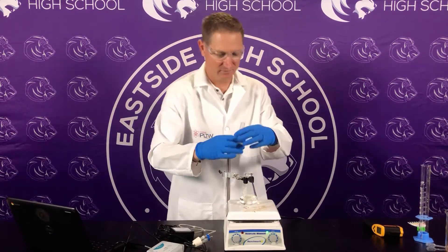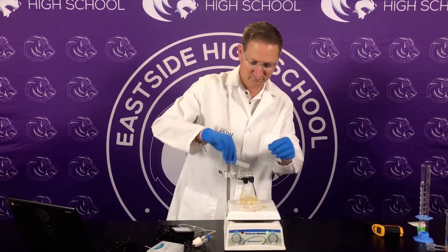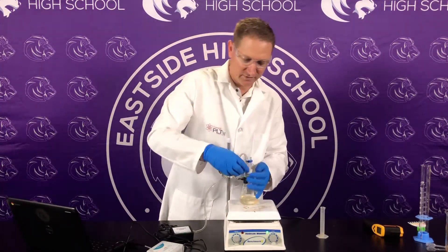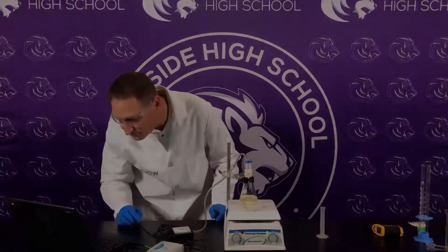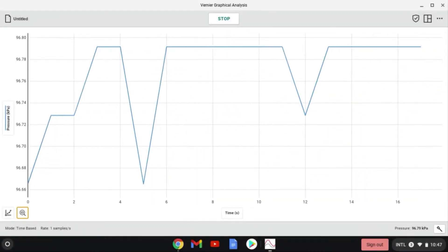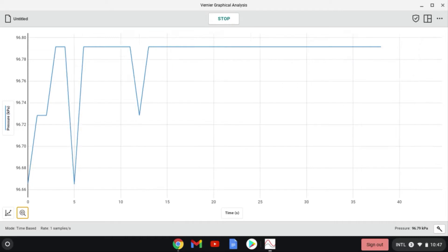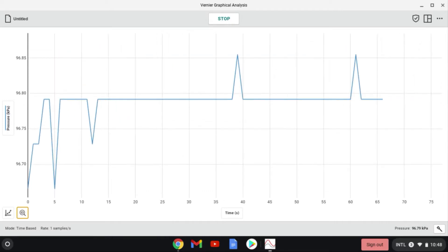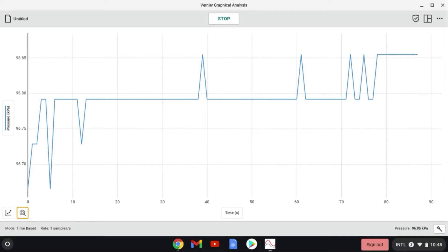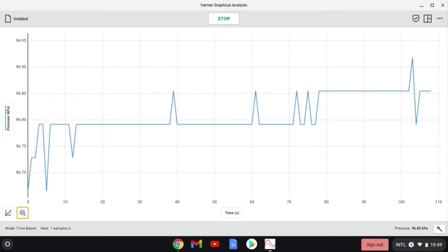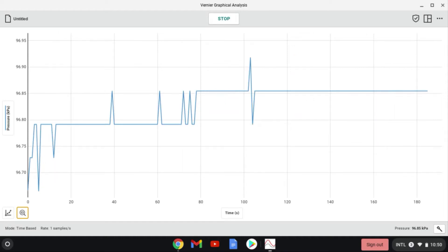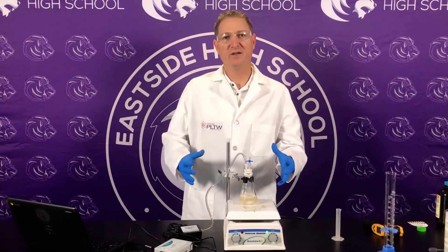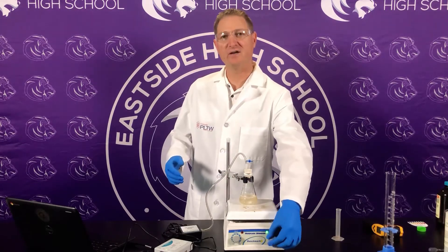We'll see what happens to the rate of reaction. Make sure this is secure — you don't want any of that pressure leaving. Collect. Now that we've collected for 200 seconds, we're going to go ahead and turn this off and move to a different pH.